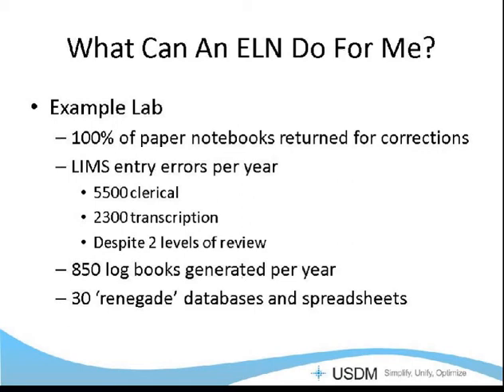I'll give you an example of one laboratory where I helped with their automation process. We did an analysis of the current steps, and every one of the notebooks that was submitted for review was returned for corrections. There was not one that ever went through the process that didn't need something changed.